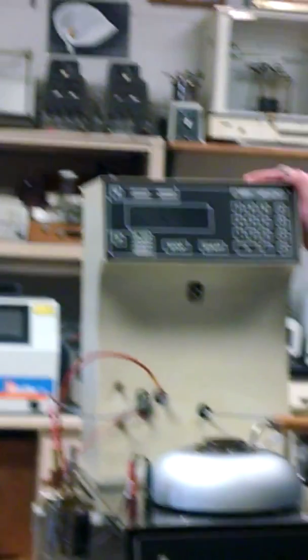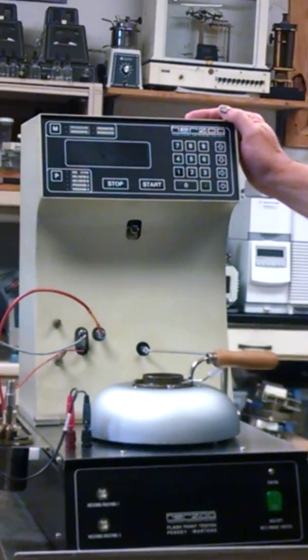Today I want to demonstrate a Herzog 329-330 automatic flashpoint tester. This here's the Herzog automatic flashpoint tester.